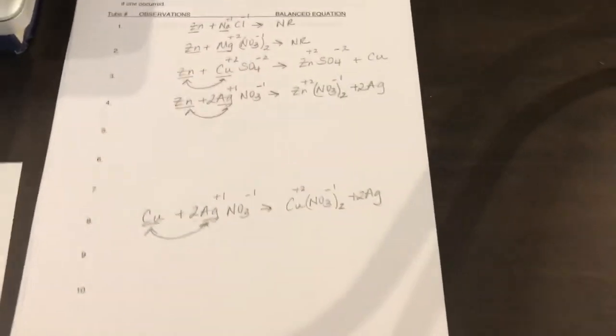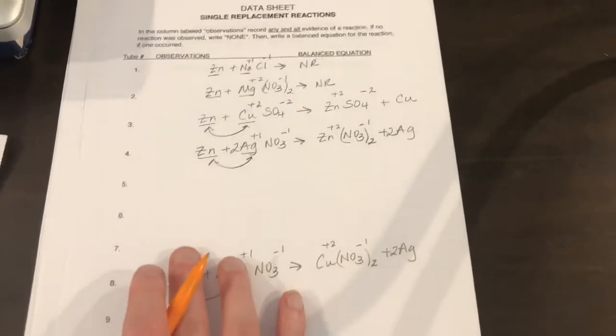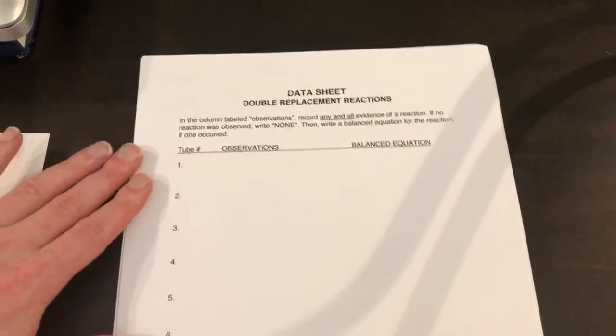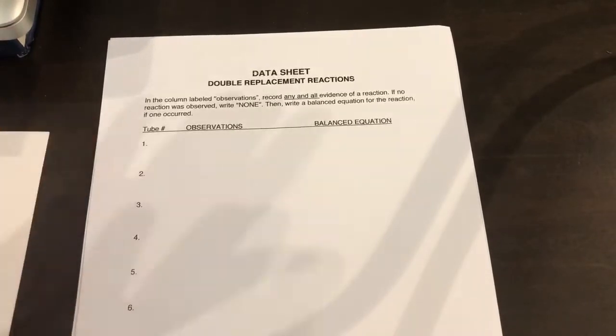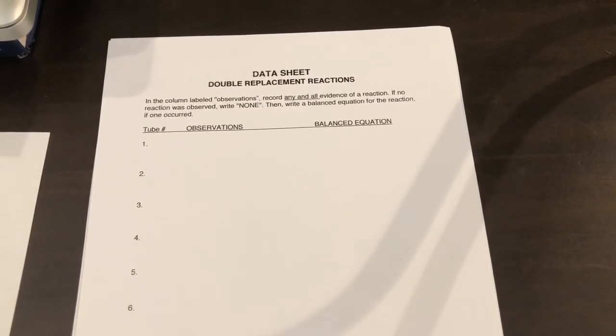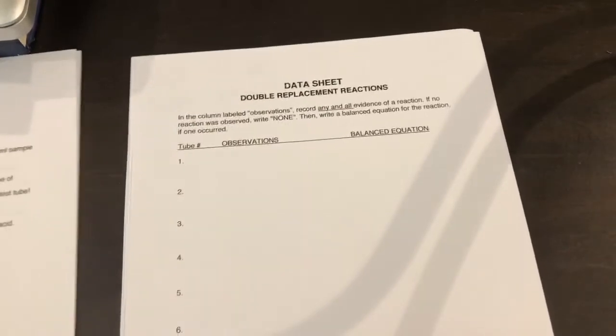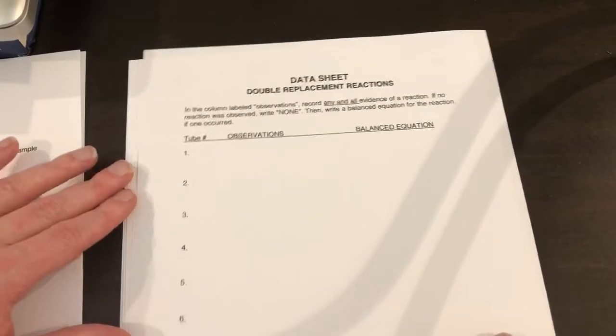Okay, now let's go on to double replacement. So in double replacement reactions, you have to make sure that you use your solubility rules. Now, whenever we're doing this in the lab, you're going to see things that actually happen. It's kind of hard to see just from pictures, so I get that. So let's look at number 1.